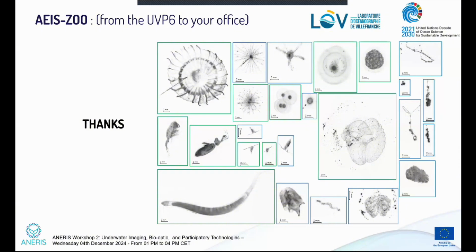One using the data for which the light was on, and one for the data for which the light was off. And basically, at the moment, we see no difference, but we keep the possibility to evaluate a possible impact of having the UV light activated on the plankton and on our observations.